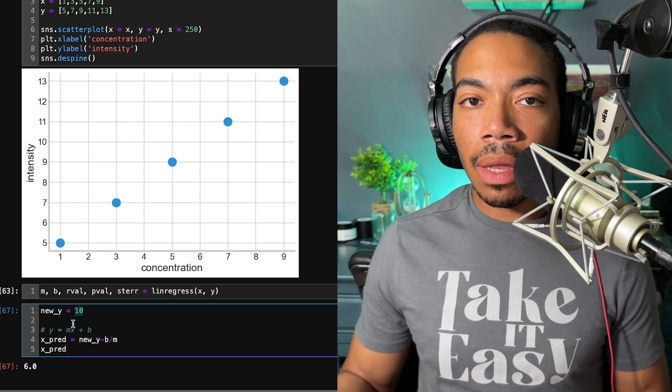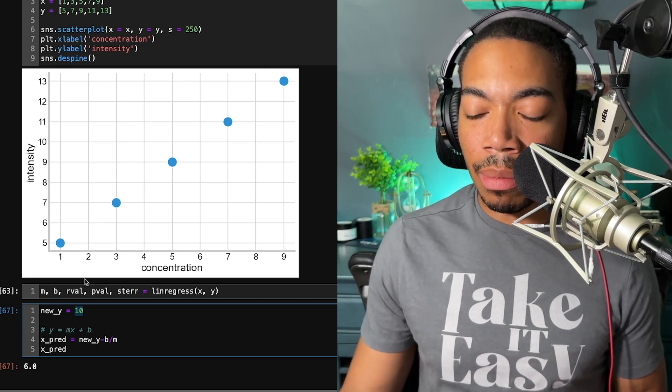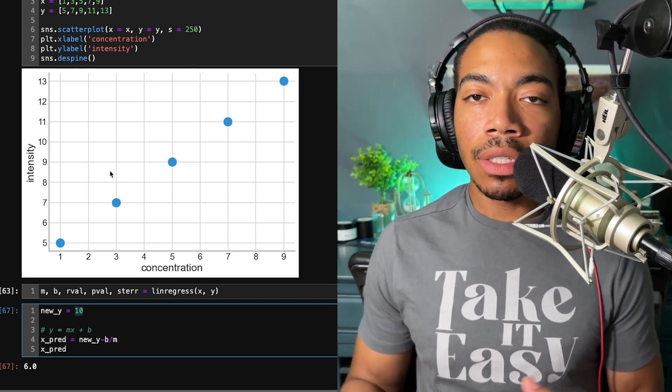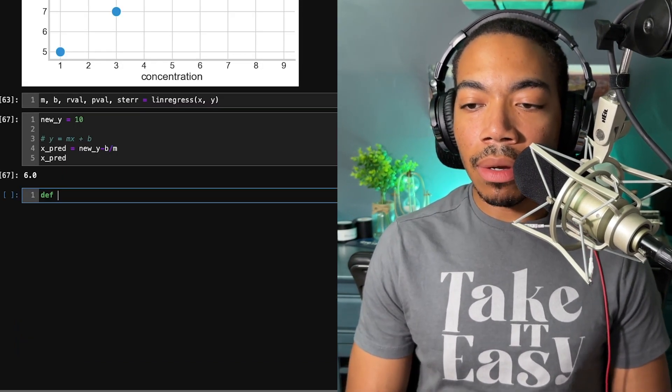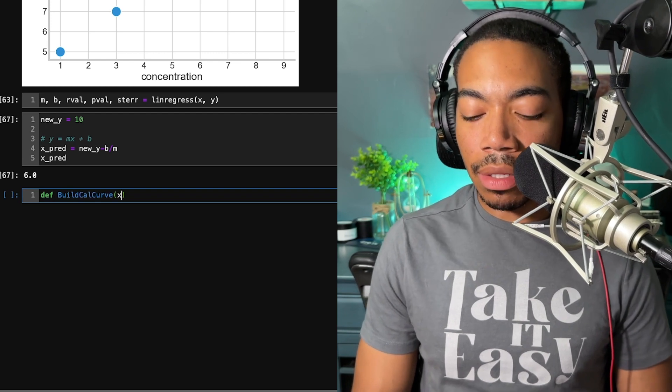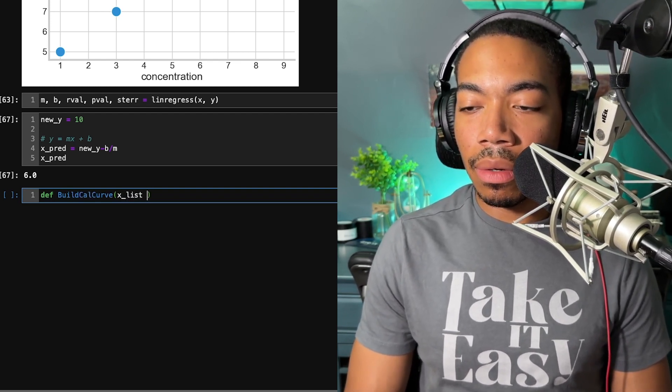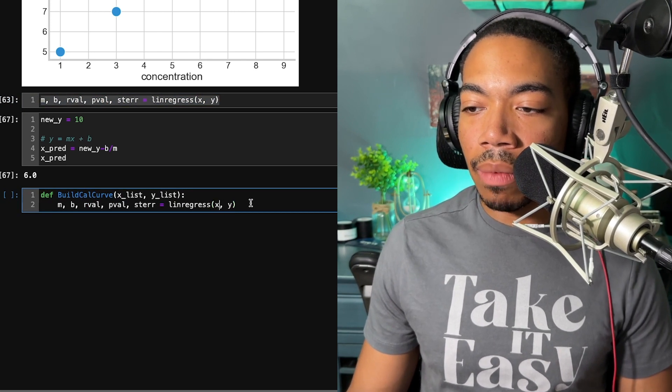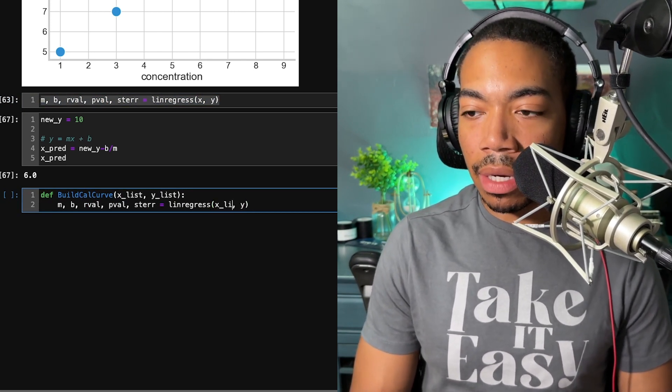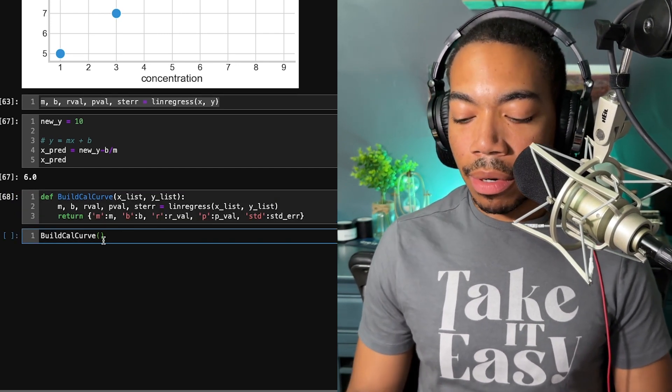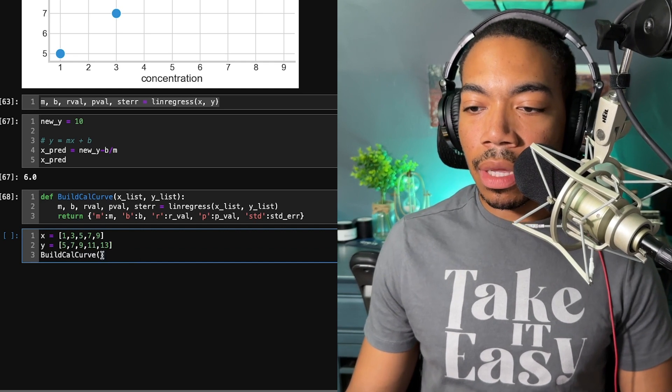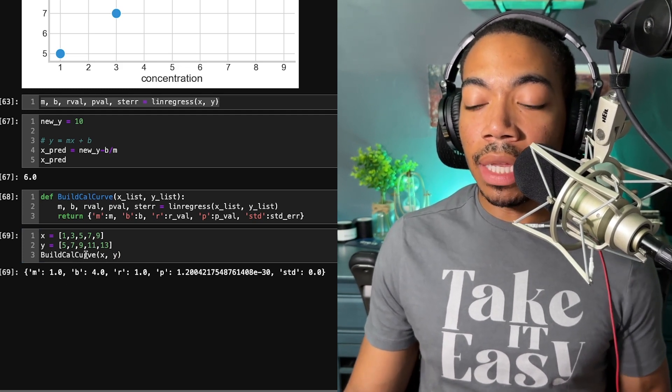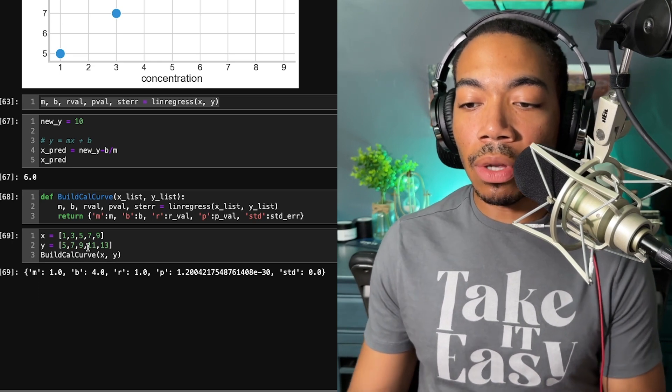And so now let's build a method that will estimate these parameters from some input values and give us this output. And then we'll pass this into a second method so that we can actually do this in a much more efficient way. So let's make a method called build_calibration_curve. And the method is going to take a parameter called x list and y list, and simply we can pass this back in. And instead of x and y, we're just going to update this to be x list and y list. And then we want to return a dictionary. And now if we build our calibration curve and pass in x for x list and y for y list, you see that we now get this dictionary of outputs that we can use to build a second function that will actually solve for x.